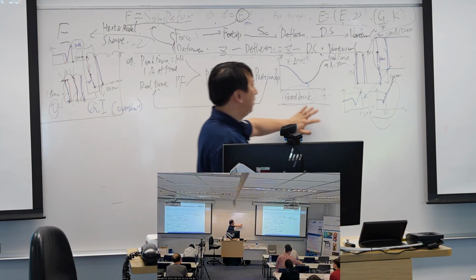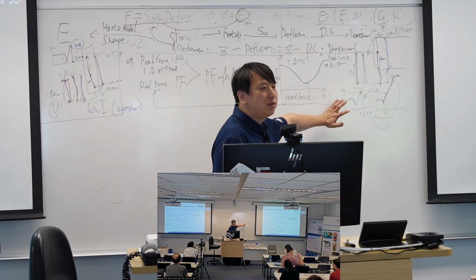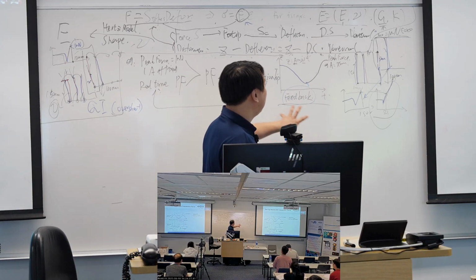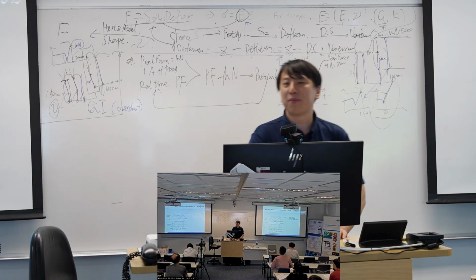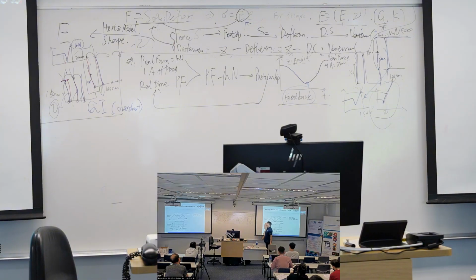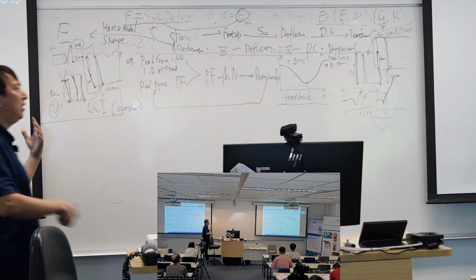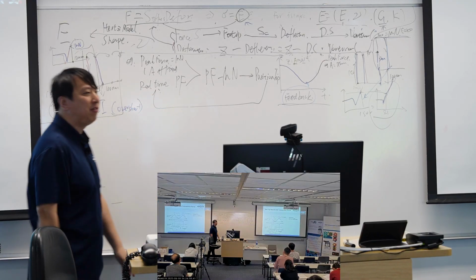But for this Dimension Icon or Dimension XR system, we will use PeakForce tapping, and with PeakForce tapping we can do it faster. The difference is that we use feedback mechanisms. So those are the two ways to do this kind of mapping on each point. There are some details, but the key point is we need to understand the feedback.